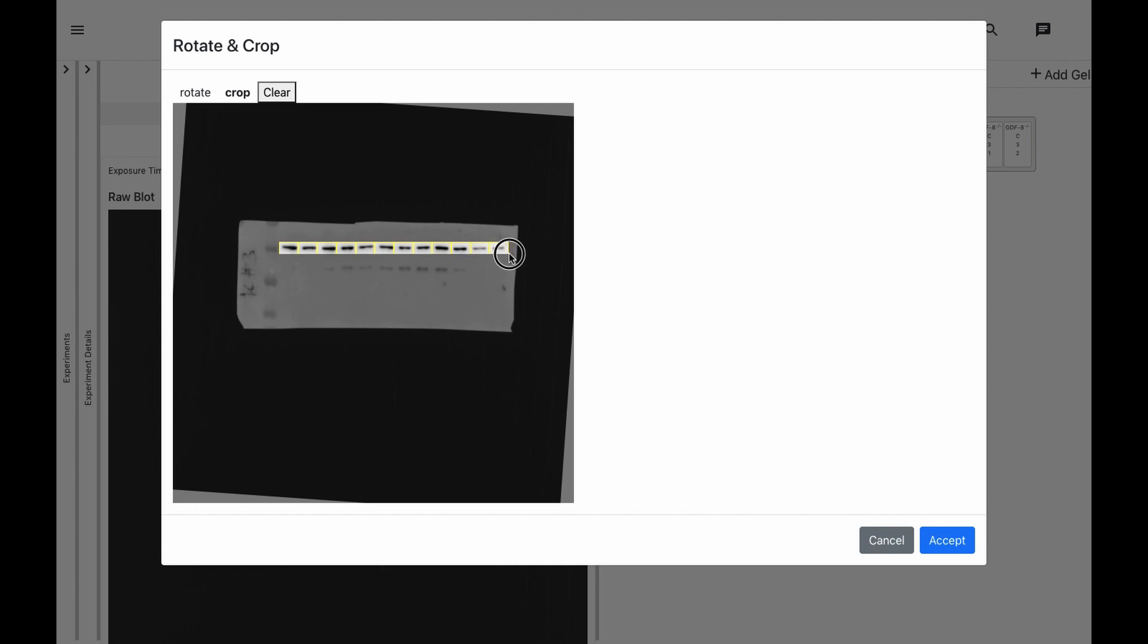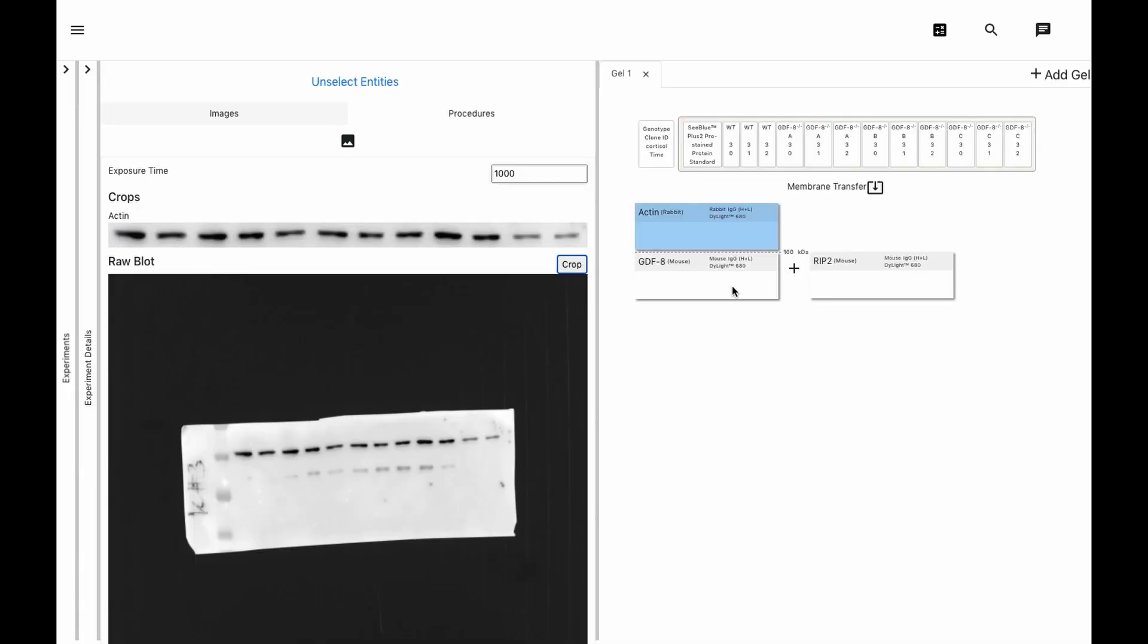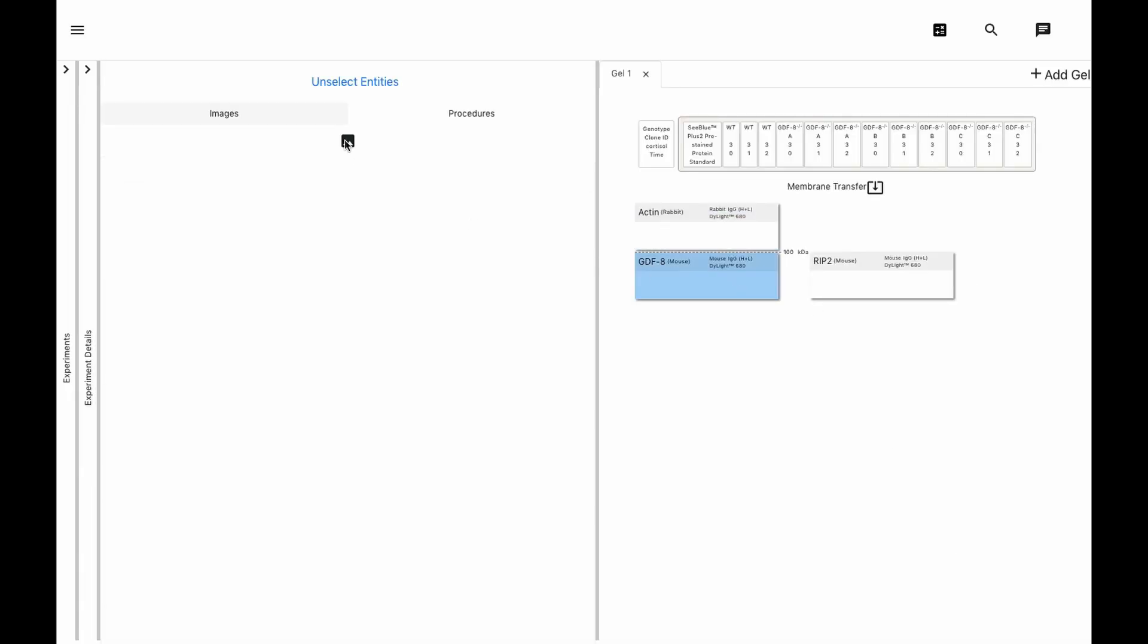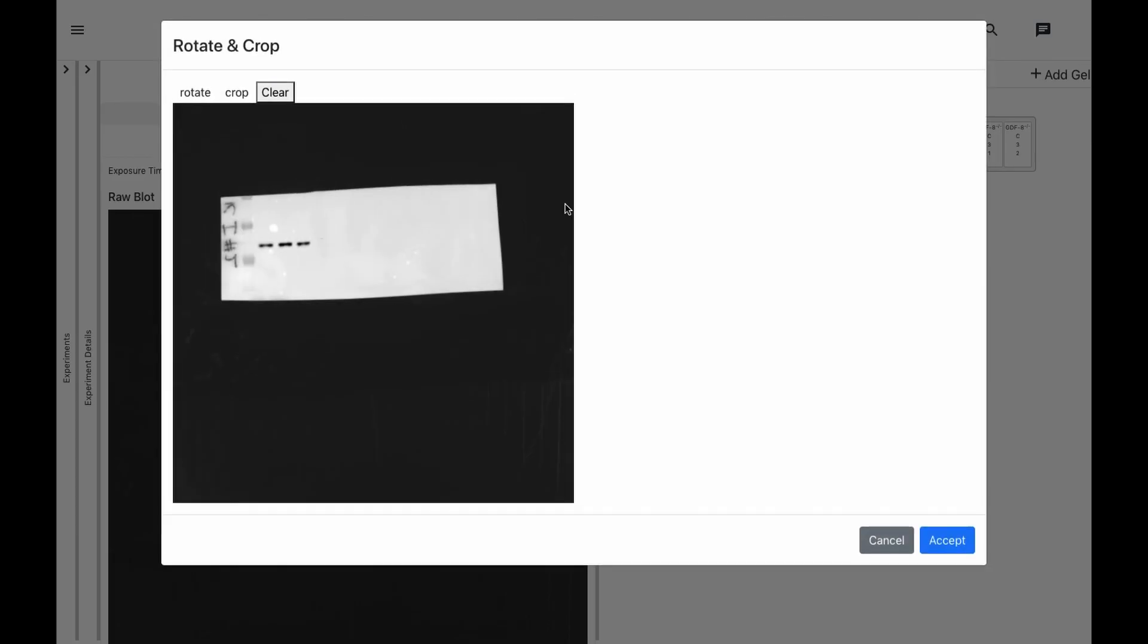And you can see on the right that the images are automatically quantified, which makes it so much easier to streamline into other computational modules, which we'll show in another video. Now we'll just upload and crop the remaining images.